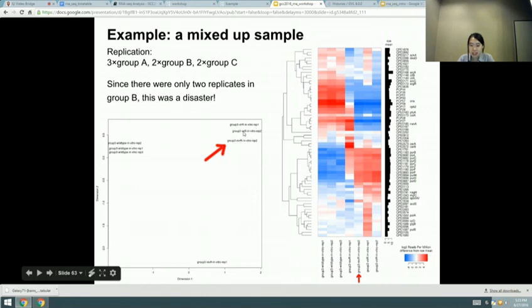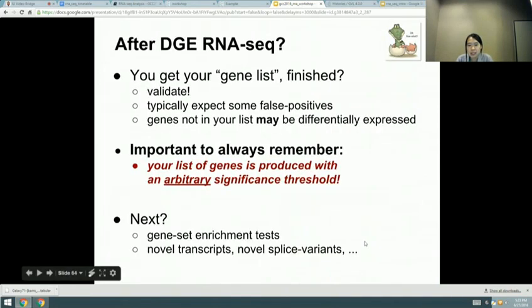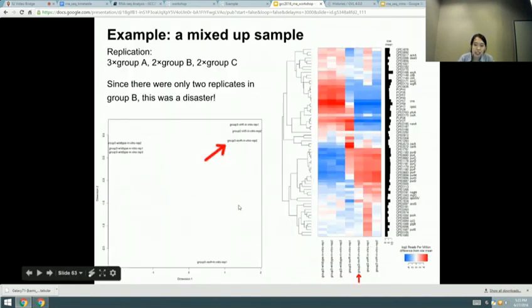In this experiment, this particular sample is called the REBR group, but it is actually clustering with the VIRR group. And if we look at the heat map, this particular sample is supposed to be more similar to this one, but it's showing that it is similar to these two. So these visualization methods are a really good idea to use when you want to check your data.